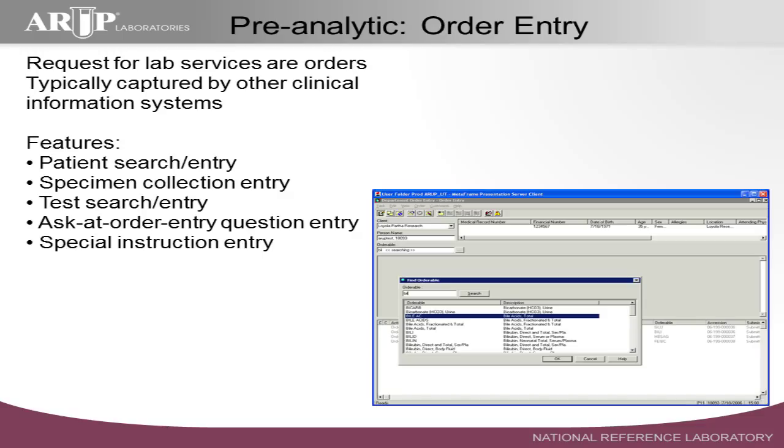So we all have to remember that orders for a laboratory are the way that the clinicians request laboratory services. They create a lab order. So that's why you hear the term order all the time. Now, if you walk up on the floors, how do the clinicians, the nurses, the docs typically refer to the laboratory service? The labs, right? Where are my labs? Somebody go get my labs.